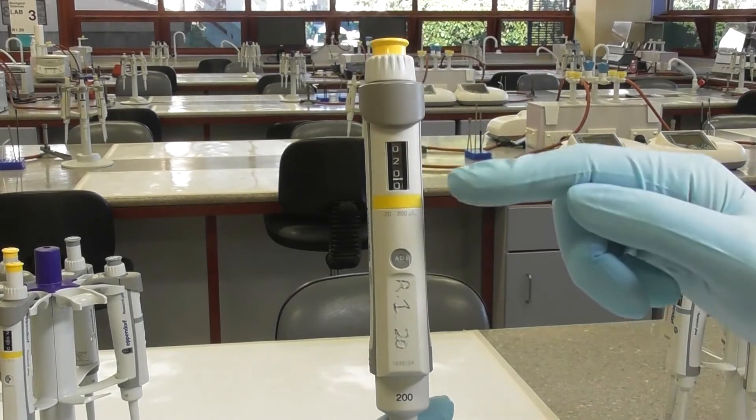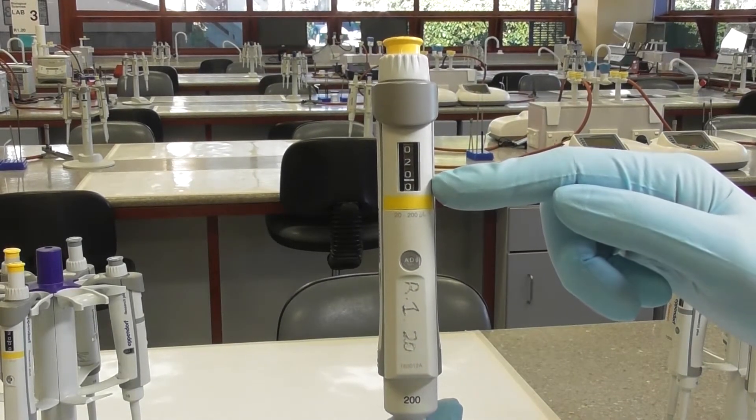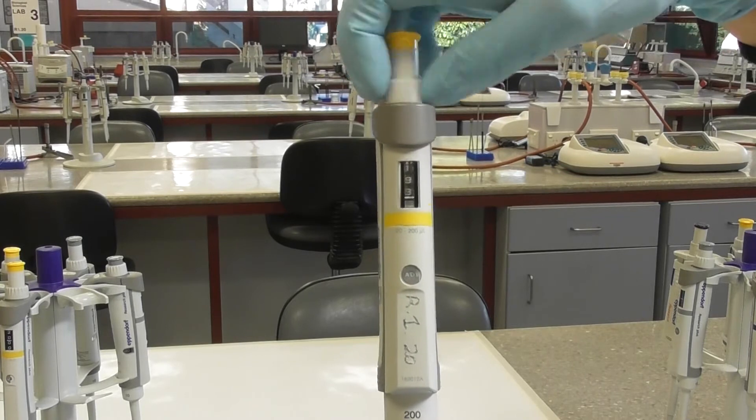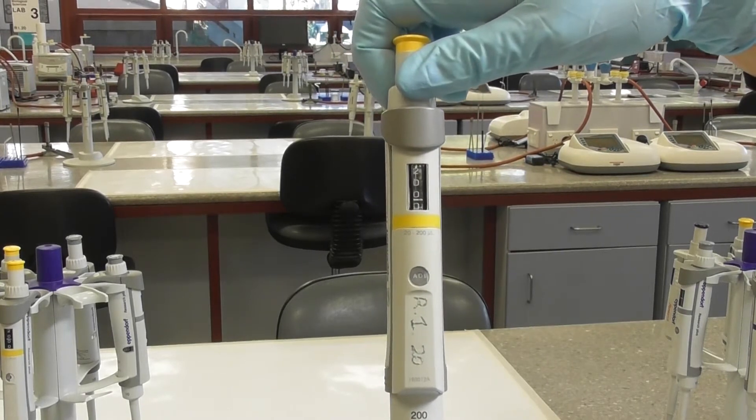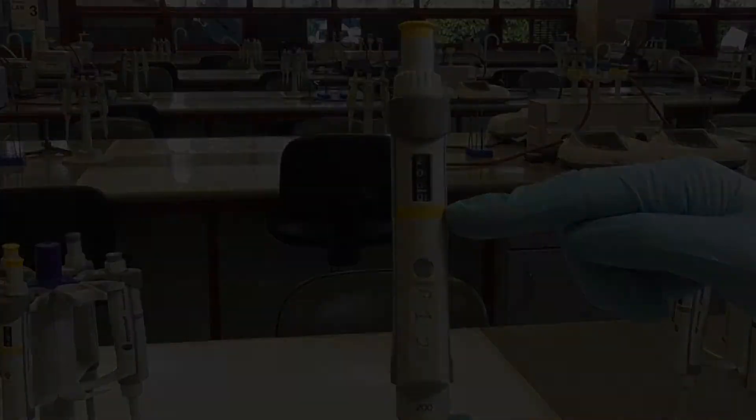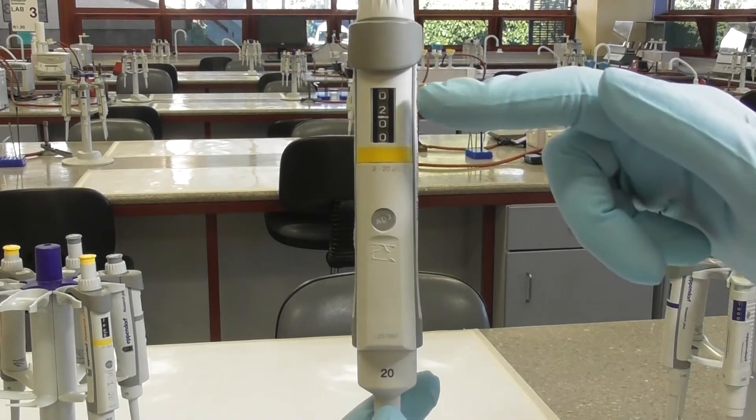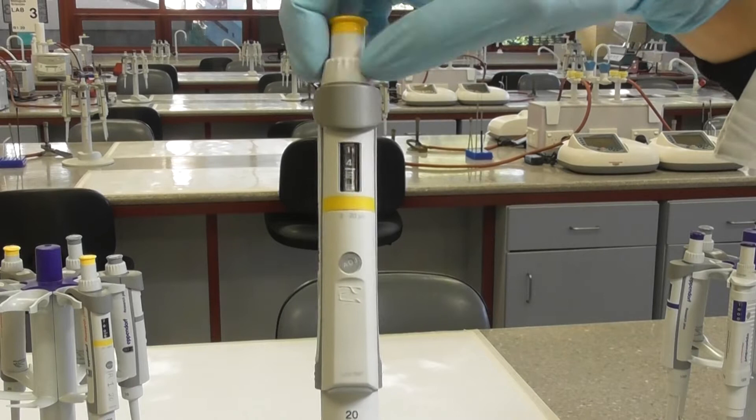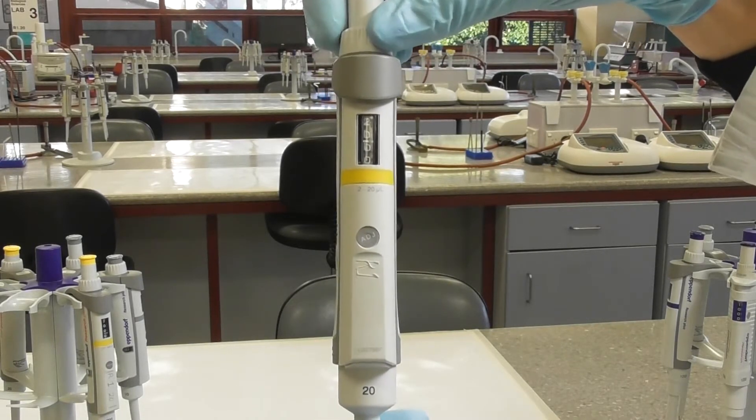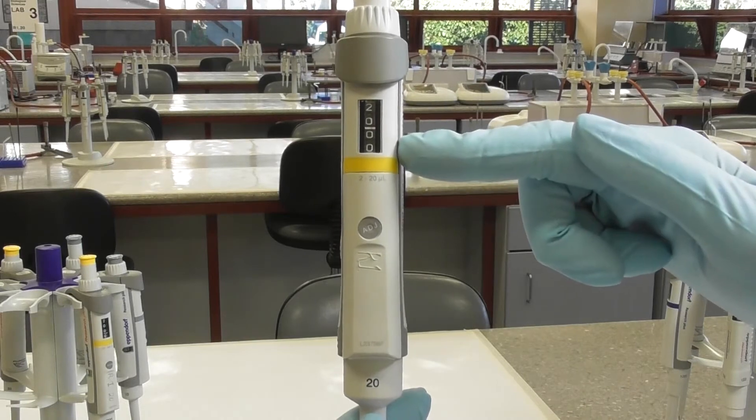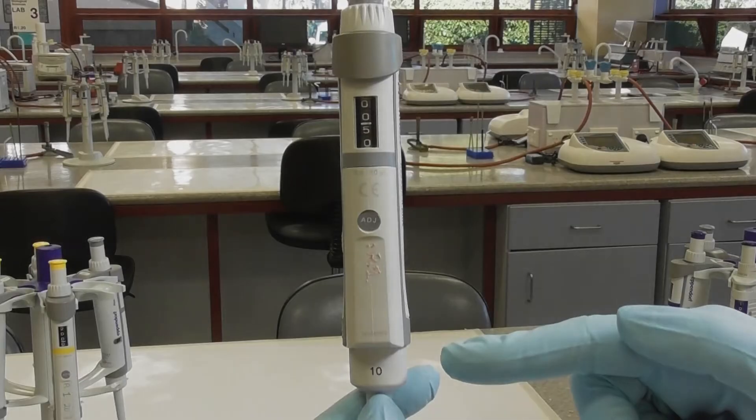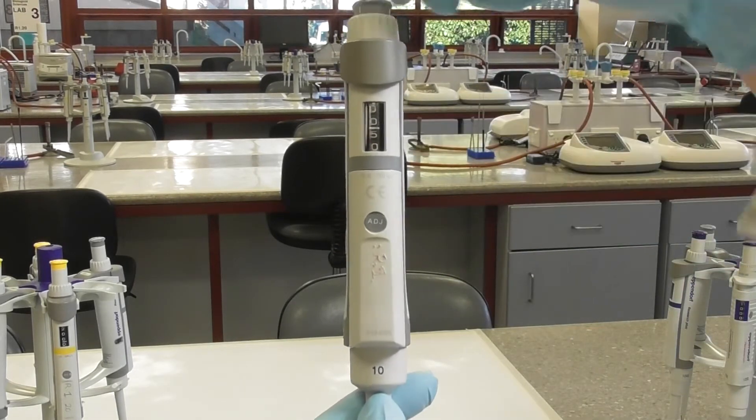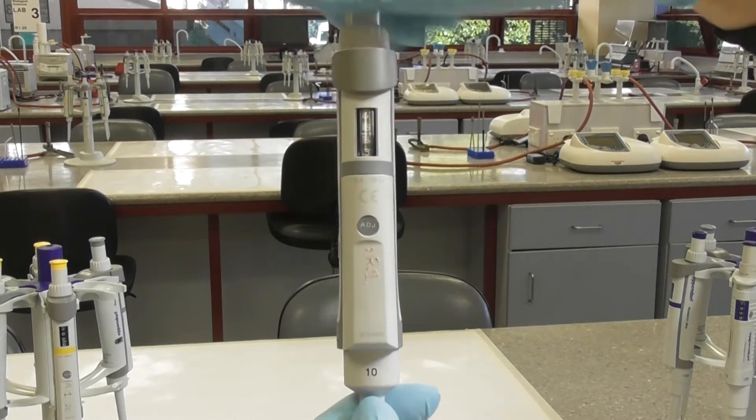The 200 microliter pipette dispenses from 20 microliters up to 200 microliters. The 20 microliter pipette dispenses from 2 microliters up to 20 microliters. The 10 microliter pipette dispenses from 0.5 microliters up to 10 microliters.